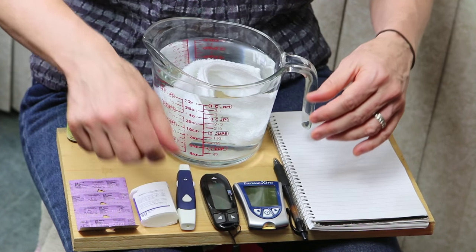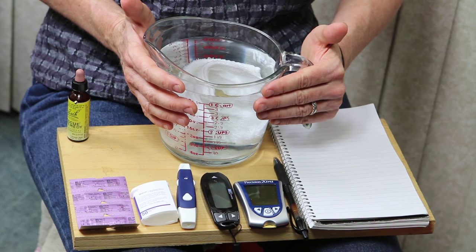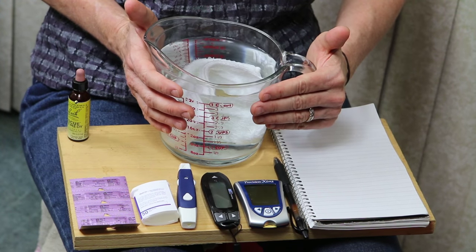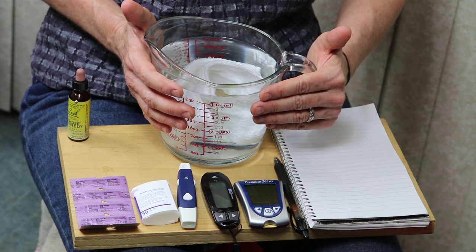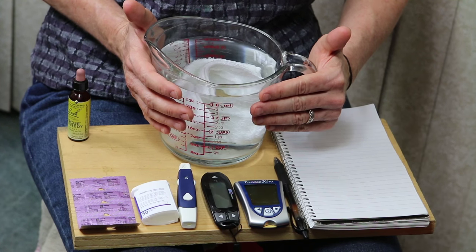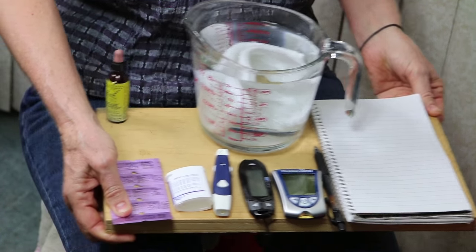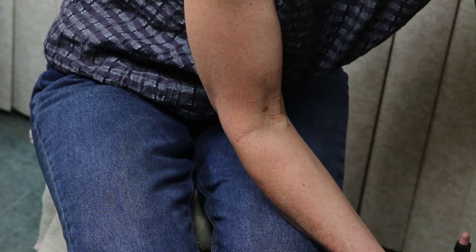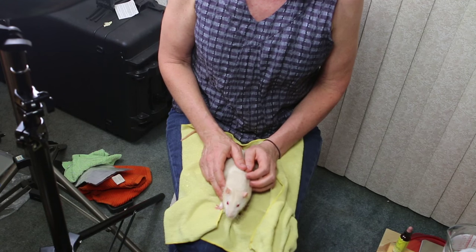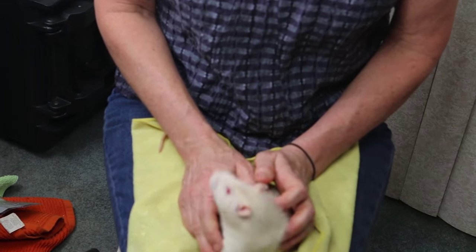I also have a measuring cup of hot water and a warm washcloth in the water. I'm going to wrap the warm washcloth around his tail — this brings the blood vessels to the surface, and after we prick the tip of his tail, blood comes more easily. So I'm going to set this aside and grab our rat, our model for today, our little guy that's going to help us demonstrate how to test blood sugar.